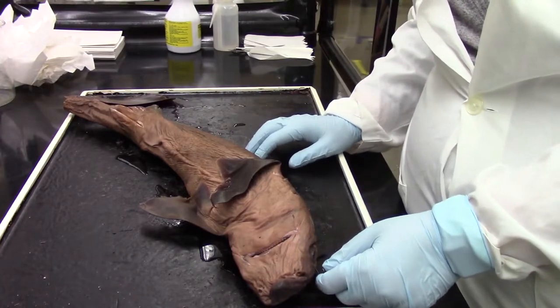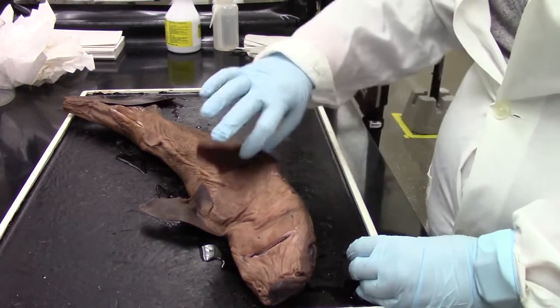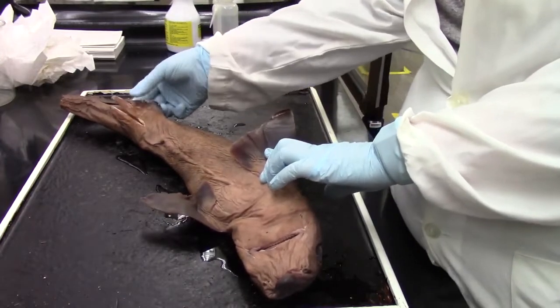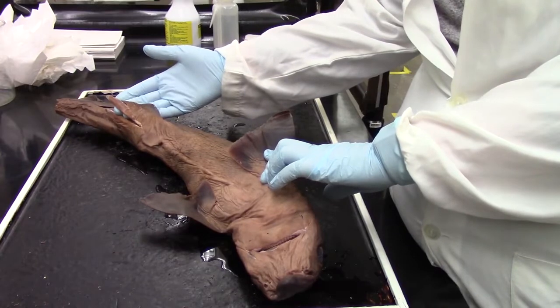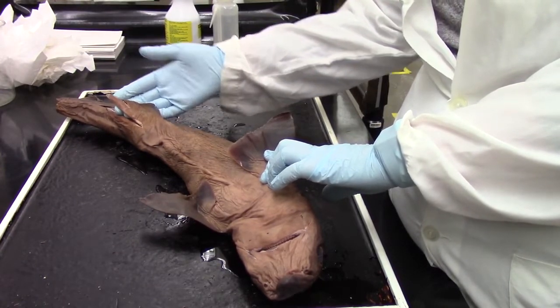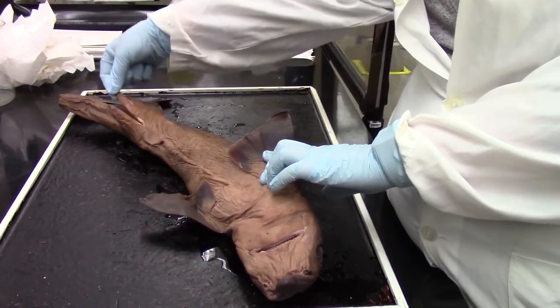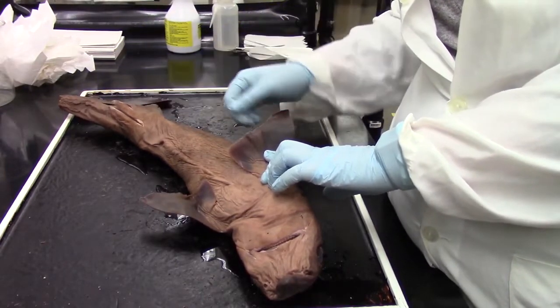While we have the animal on the ventral side, let's point out a couple of the fins. So here we have the pectoral fins. And then back here, we have the pelvic fins. We'll get a closer look at the pelvic fins when I go to start the dissection, but these ones are specifically structured so that we have the pelvic fin and the clasper. So this is a male dogfish.